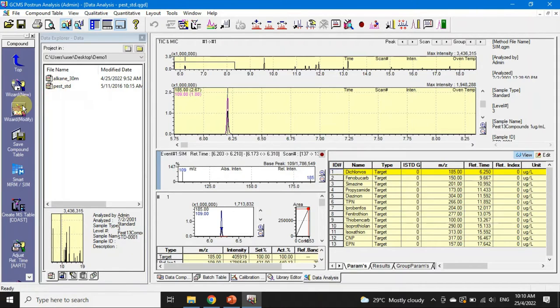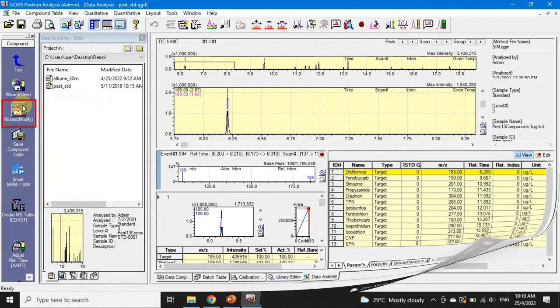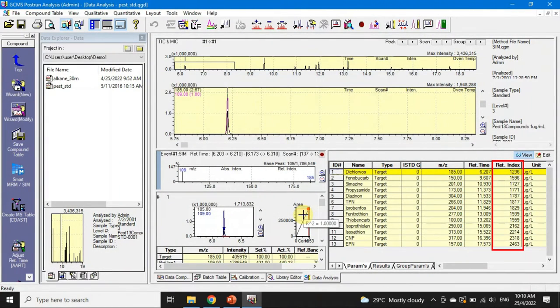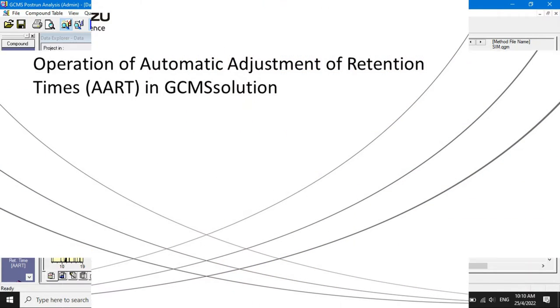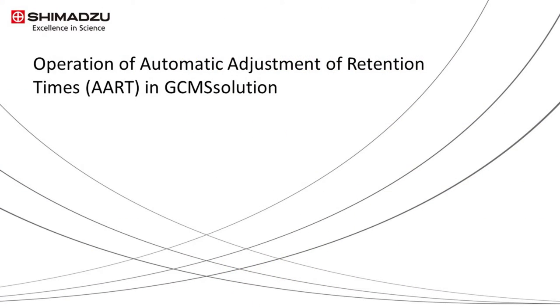Next, proceed to calculate the retention times of target compounds. Load the standard data file — here the retention index of compounds are still zero. Use the wizard modify icon to create the retention index of the compound automatically. The retention indices of target compounds are calculated and updated in the compound table.